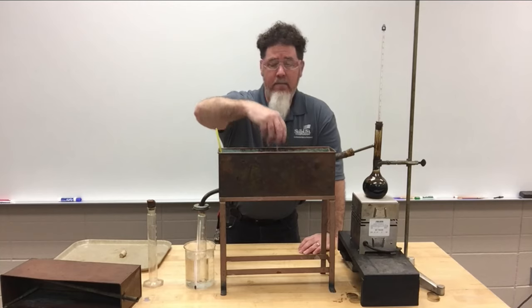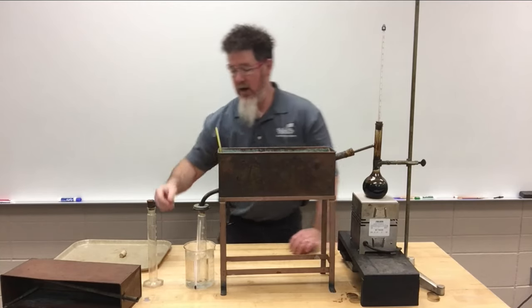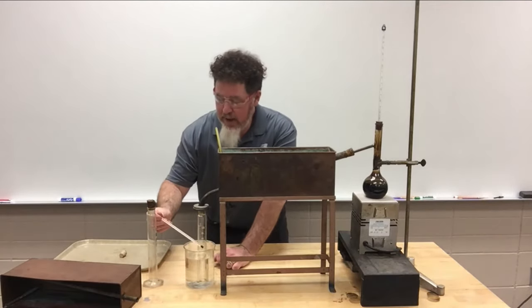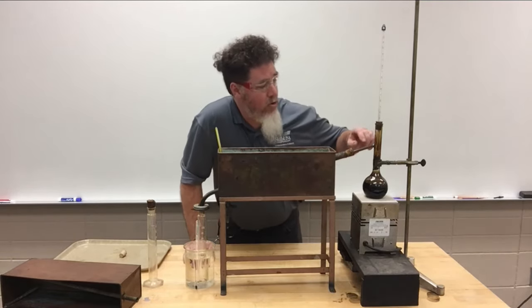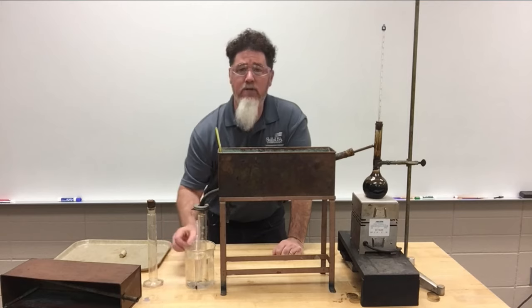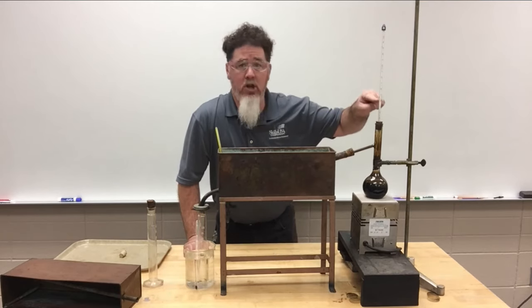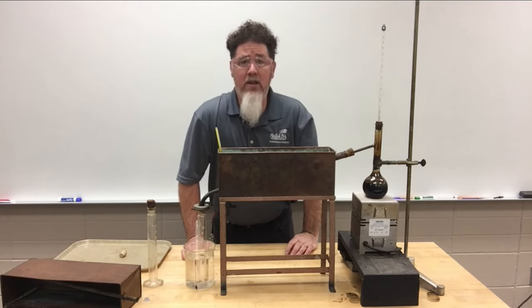I got my bath of ice water down to about 40 degrees. My graduated cylinder here is empty. I have an ice bath there that's around 40 degrees also. And so all we're doing is waiting for the vapors to start to come out and see what the first drop is. So we'll watch very carefully over here to see when the first drop comes out. And when the first drop comes out, we're going to come over here and look and see what the temperature is. That's going to be the start of the actual distillation process of collecting gasoline.